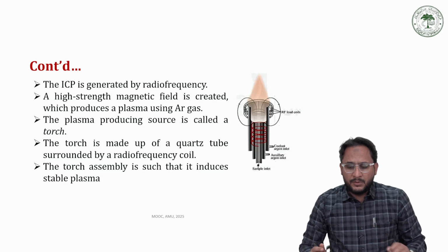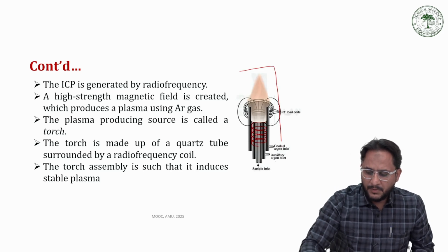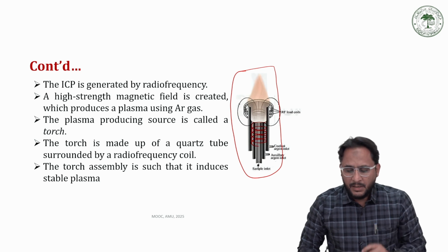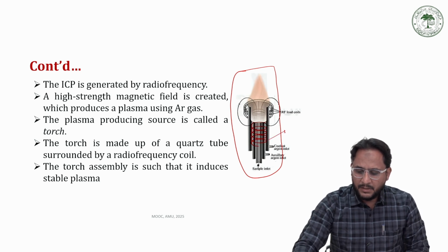This ICP uses a plasma torch. This is the plasma torch, which is basically used to create the plasma, and this plasma torch is made up of quartz.